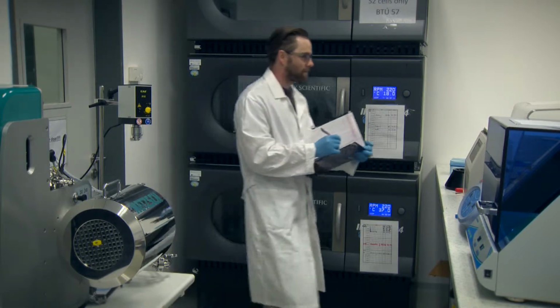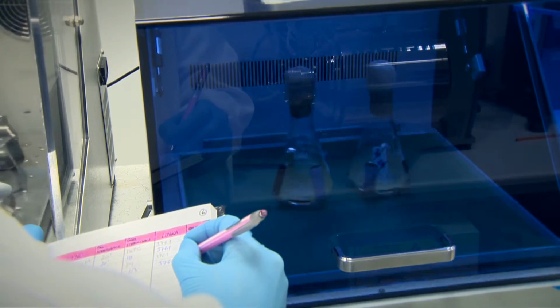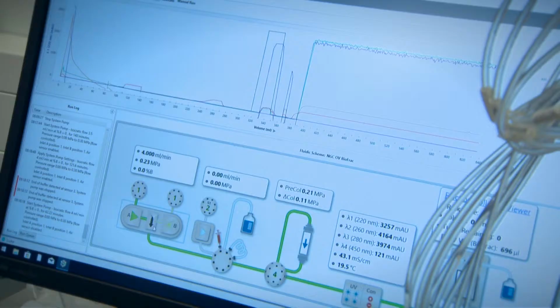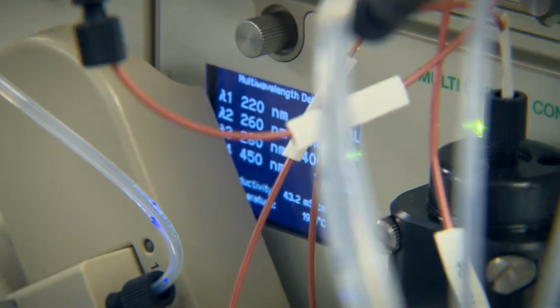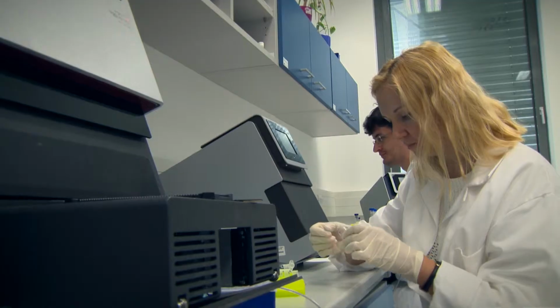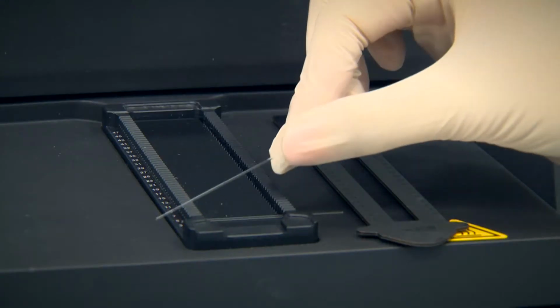The process starts in the laboratory, where cell cultures are grown and thereafter provide studied proteins. Most of our experiments require an active and highly pure protein. It's obtained from a cell suspension by way of purification that uses high-performance liquid chromatography methods. As the next step, pure proteins are characterized.